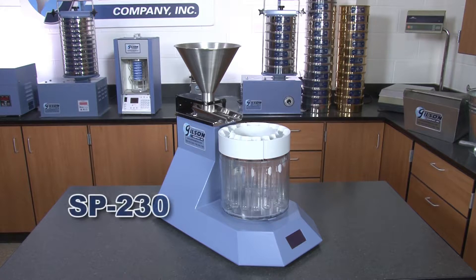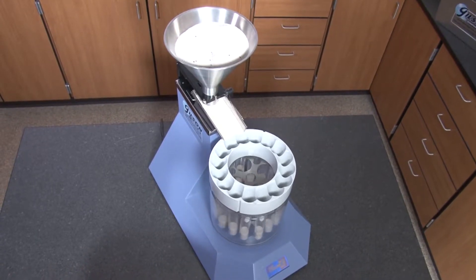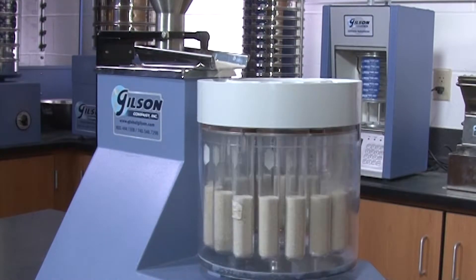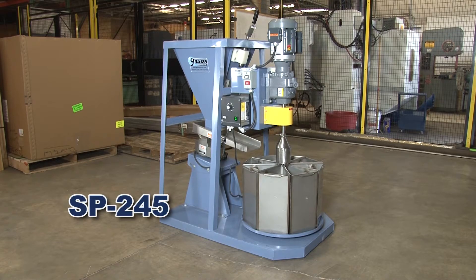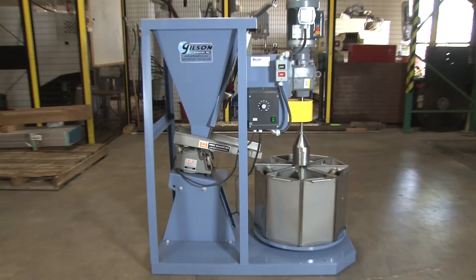Gilson's Spinning Riffler or Rotary Sample Divider are precision-made instruments for improved accuracy. The Laboratory Spinning Riffler model is a tabletop size to process finer material, and the Acumax Spinning Riffler is designed to split coal, ore, and other aggregates.